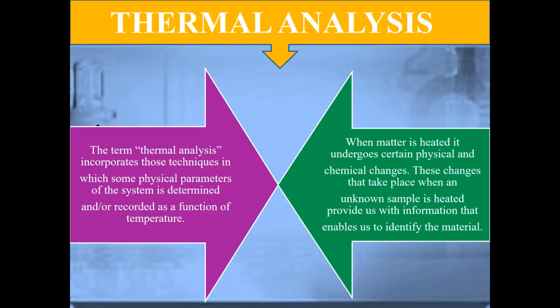Thermal analysis. The term thermal analysis incorporates those techniques in which some physical parameter of the system is determined or recorded as a function of temperature. When matter is heated, it undergoes certain physical and chemical changes. These changes that take place when an unknown sample is heated provide us with information that enables us to identify the material.